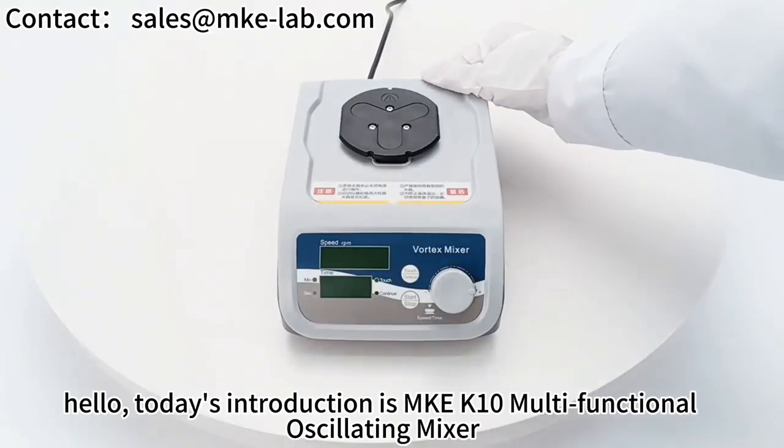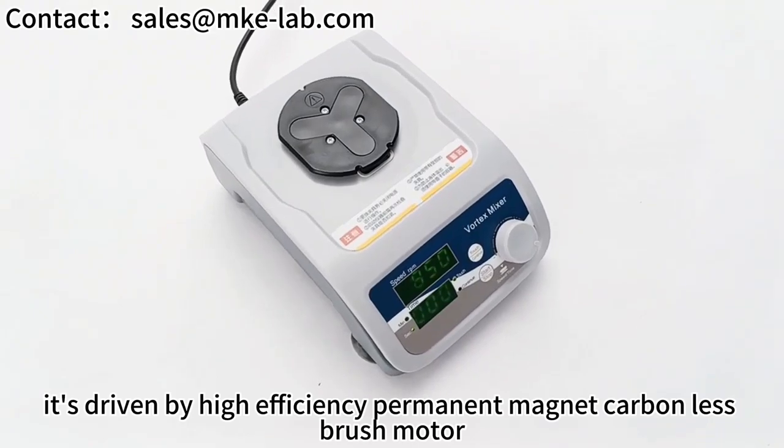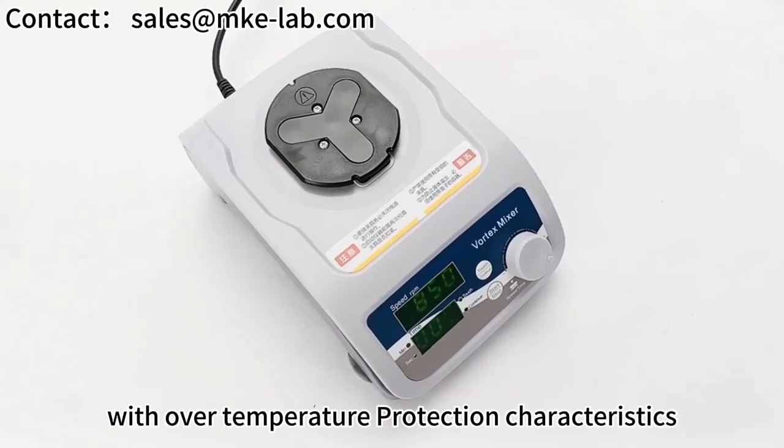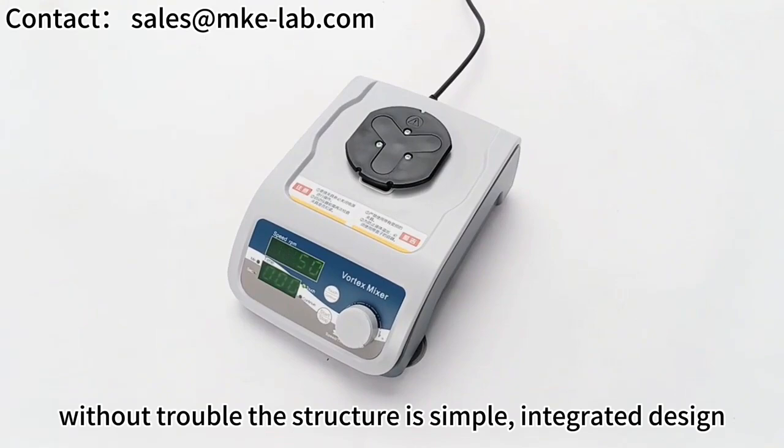Hello, today's introduction is the MKEK10 Multifunctional Oscillating Mixer. It's driven by a high-efficiency permanent magnet brushless motor. It doesn't heat up easily, with over-temperature protection characteristics, ensuring that high-speed mixing can still work for a long time without trouble.